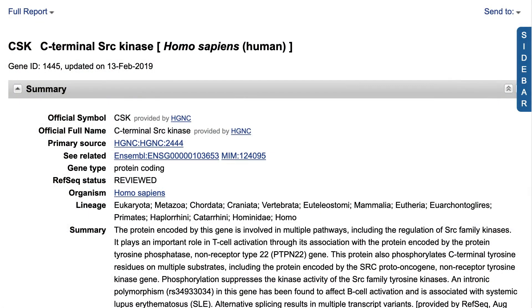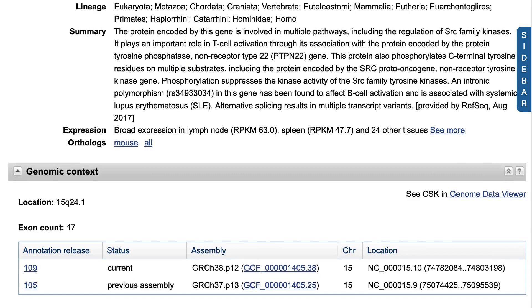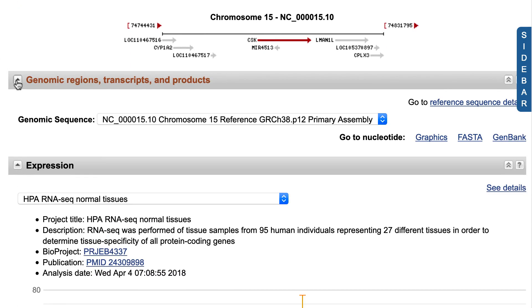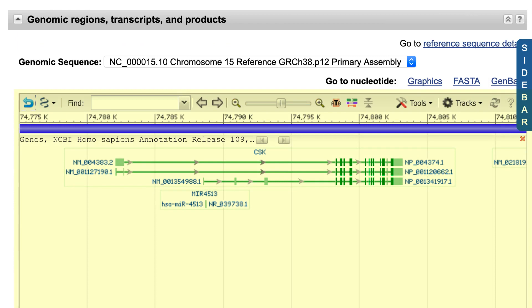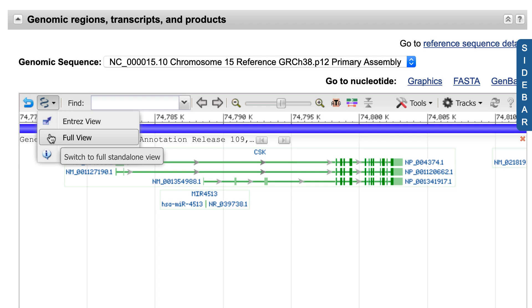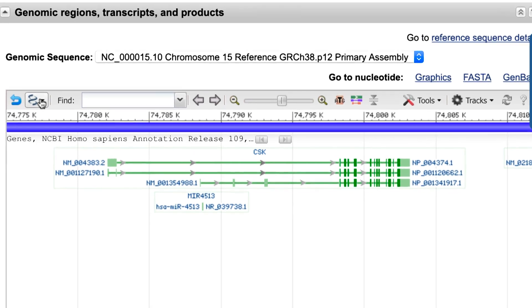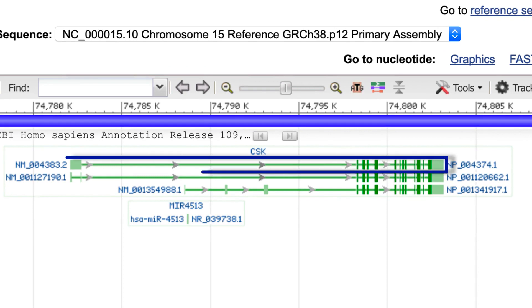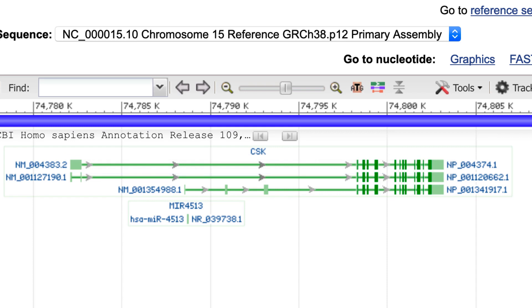Today I'll start in the gene record for Human CSK. In the section called Genomic Regions, Transcripts, and Products, you'll see the embedded sequence viewer. You could pop this viewer out into its own tab or window using the helix icon menu. You will likely see the gene tracks in a configuration where transcript and CDS pairs are merged on a single line, and there is no gene bar.